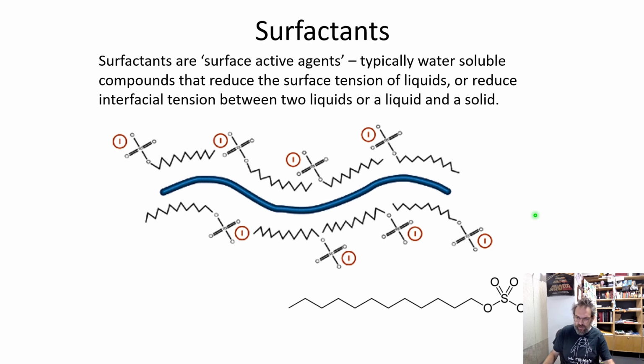There's loads of different surfactants. SDS is one of the most popular. Anionic detergents are very popular. The other main anionic detergent that you will see a lot in the literature is sodium deoxycholate. That has become very, very popular because trypsin, which you use to create peptides from your proteins, is active in very high concentrations of deoxycholate, typically up to 1%, whereas with SDS, you need to dilute it down to below 0.1% to be able to have the trypsin be active.